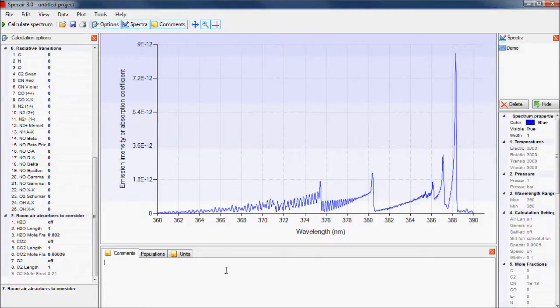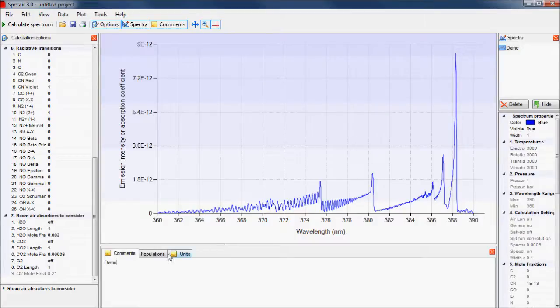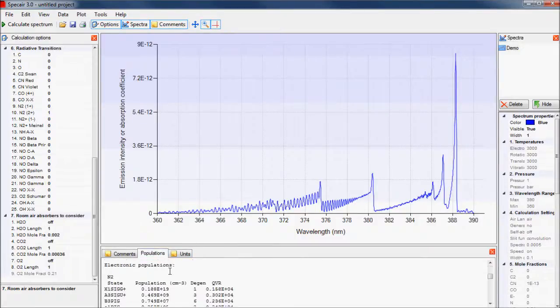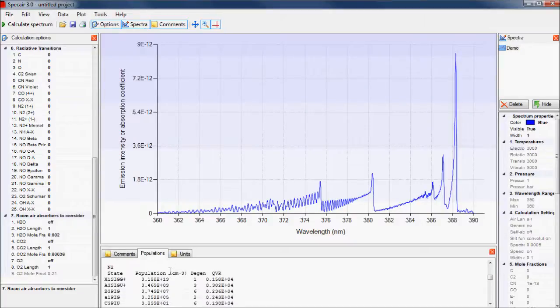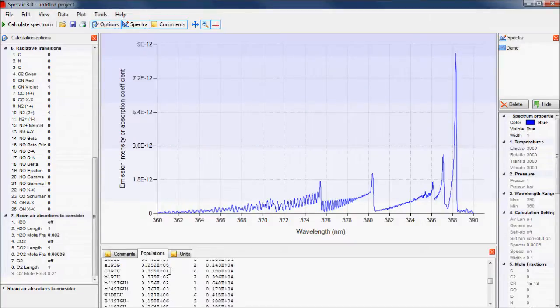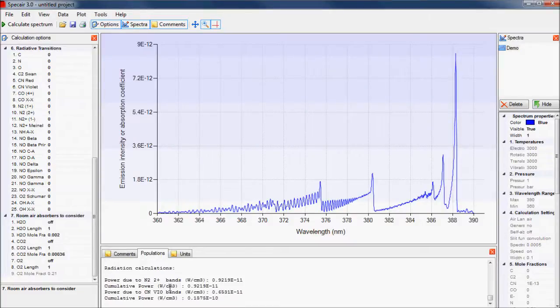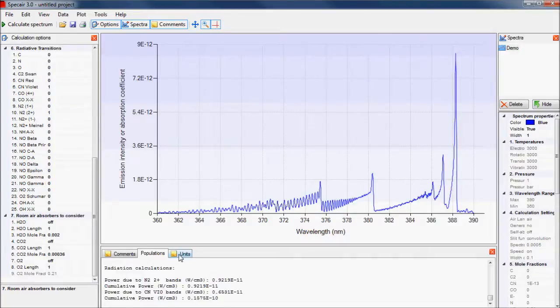In addition to the calculation options, we can add our own comments for each spectrum in the middle bottom panel. We can also see what the electronic populations were in each state and see the total power emitted.